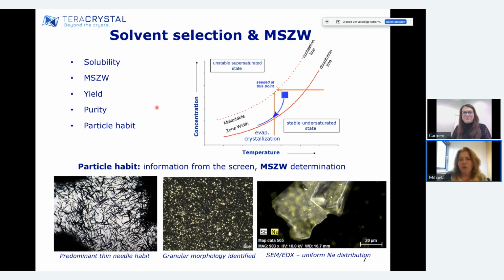All right. So as just mentioned, for analytical capabilities, it's quite important that at the moment that you have identified the particle morphology, particle size, and you have the process that you want, then you can also look into very huge detail at how things are in your product, how, for instance, sodium is distributed in certain particles.